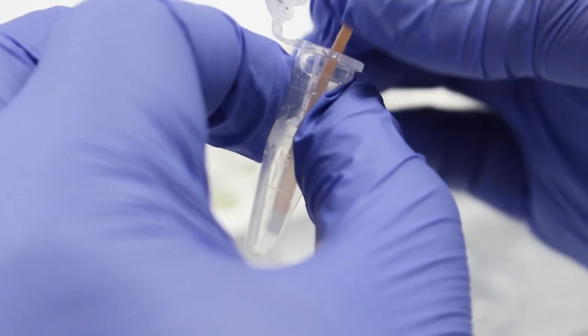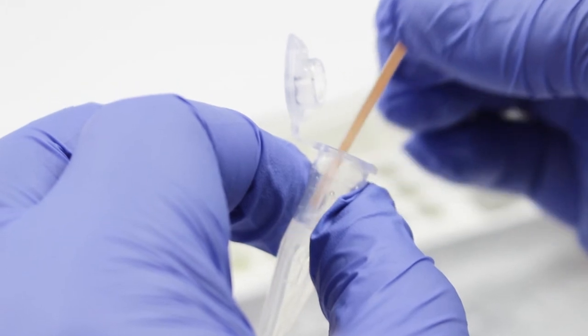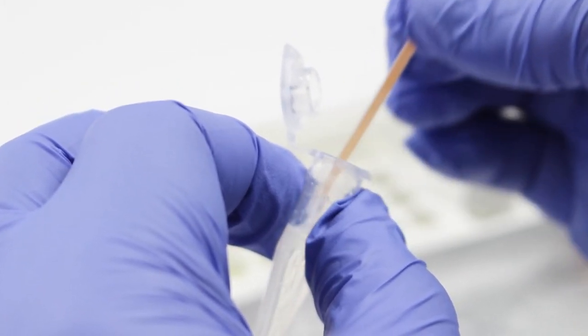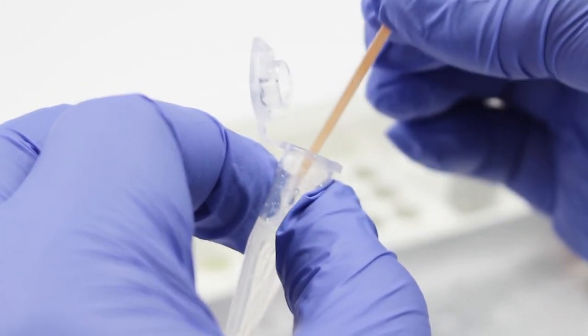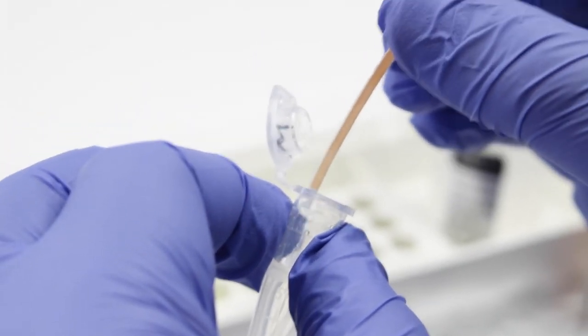Then gently dip the dipstick into the tube of wash buffer five times. When you remove the dipstick, check that there are no large droplets of buffer on the dipstick. If there are, gently touch the dipstick to the edge of the tube to remove the droplets.